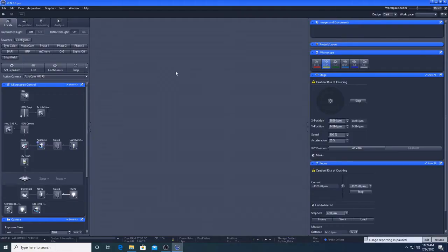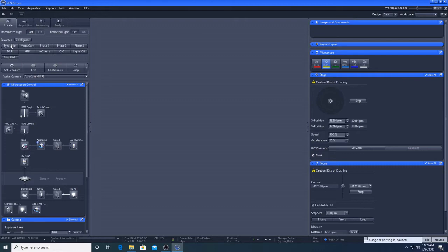We will start by describing the layout of the software. This is the Locate tab that we can use for finding our sample via the Oculus or the camera and to check the abstainings of work. We will be spending most of our time on the Acquisition tab where we will create settings specific to our sample and taking our images.